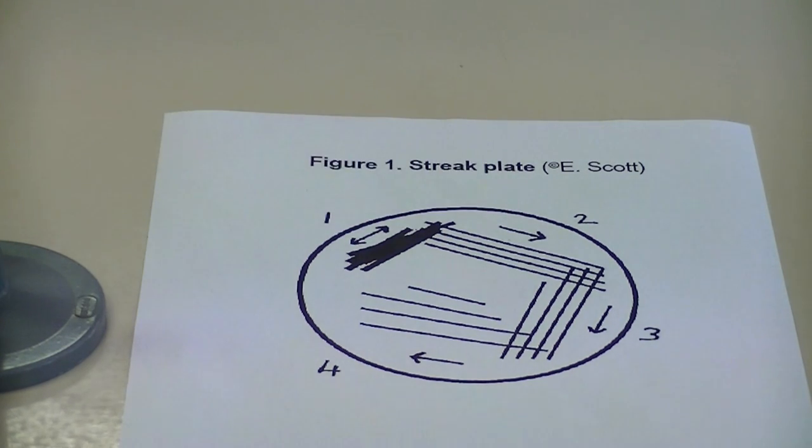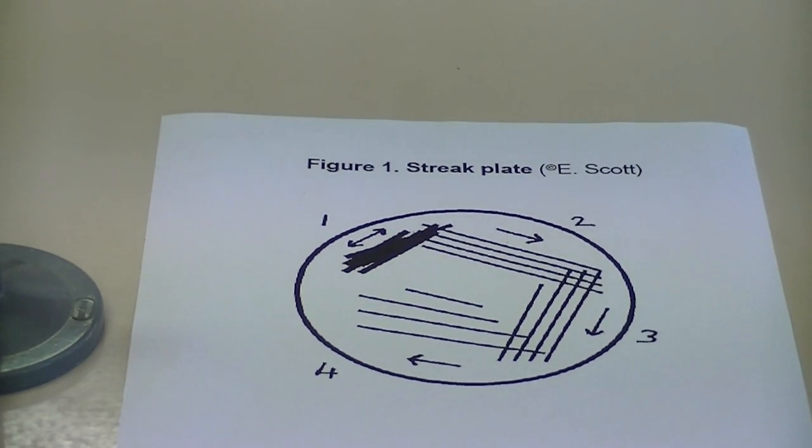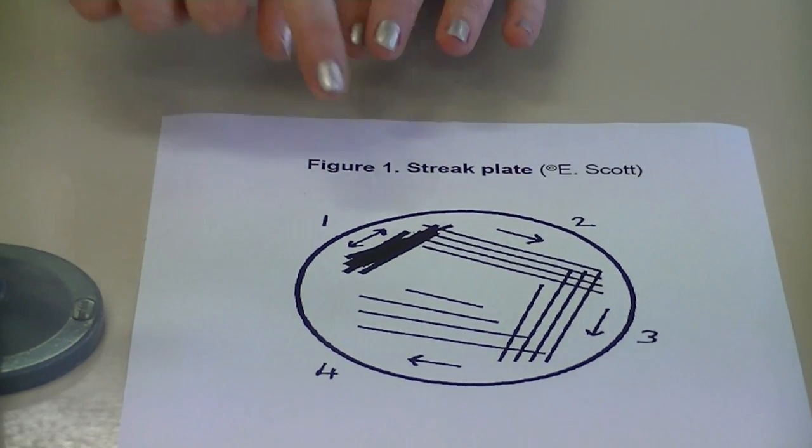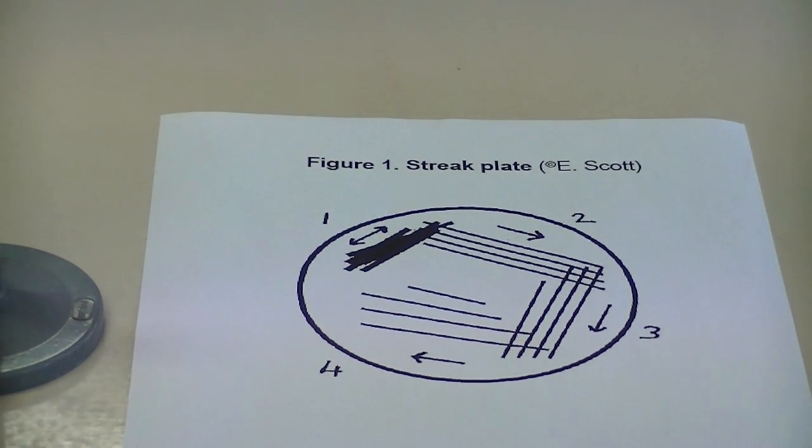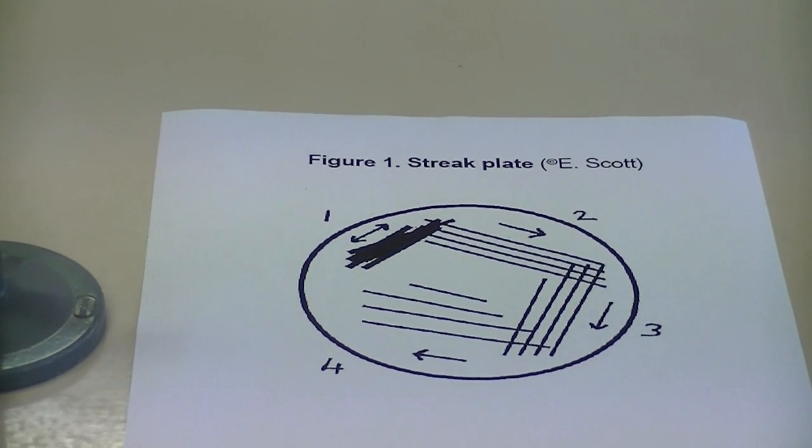The purpose of the streak plate technique is to dilute the number of cells so that when you get to your quaternary lines, you should have individual colonies. One viable cell from a bacteria or yeast usually gives rise to one colony.